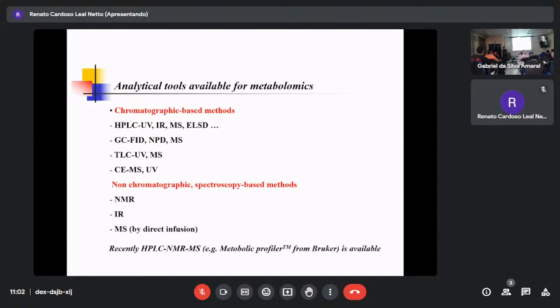But this HPLC-NMR is for qualification. Qualification, we can use it, but for generating the metabolic data, I think it takes some time, because one sample measurement, how long does it take? It's more or less 1 day. One sample, 1 day is too much.